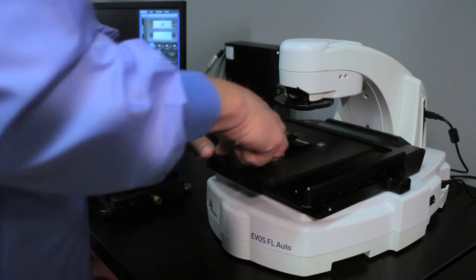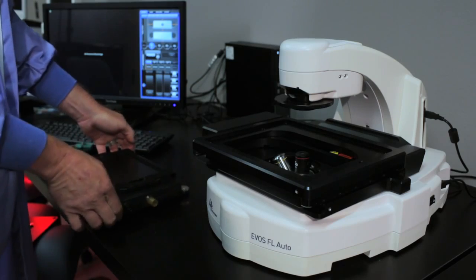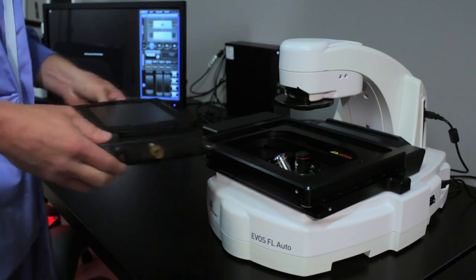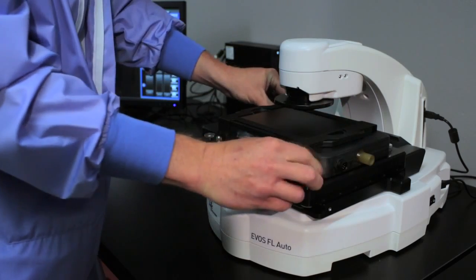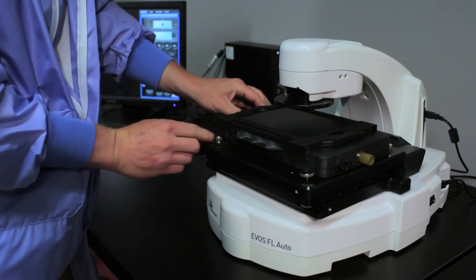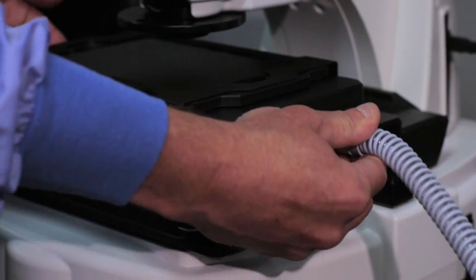Remove any stage adapter currently on your EVOS FL Auto System and replace it with an On-Stage Incubator Adapter. Secure the On-Stage Incubator Master Plate to the XY stage using the four thumb screws. Connect the data cord and tubing to the On-Stage Incubator Adapter.